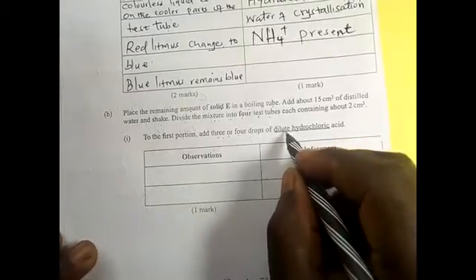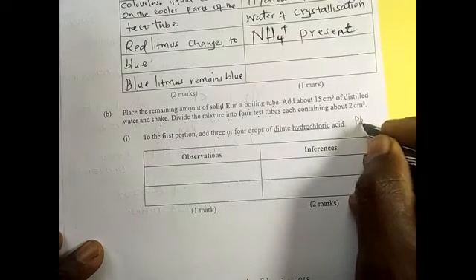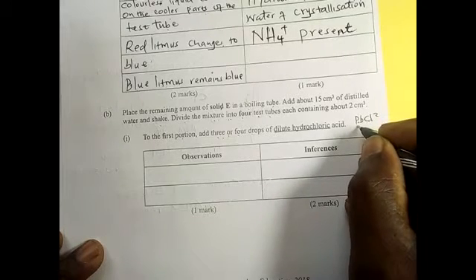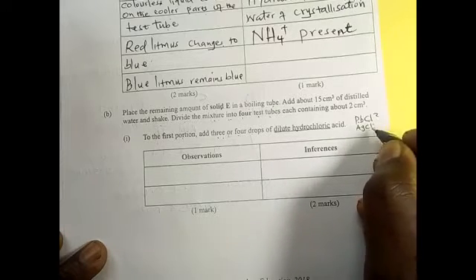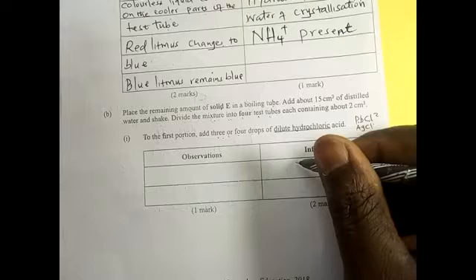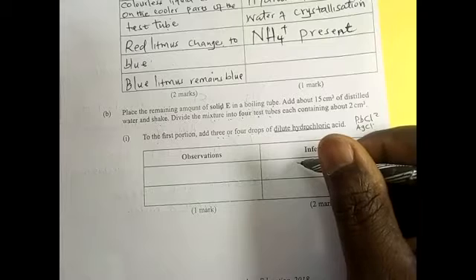Always when you are adding dilute hydrochloric acid, you expect a white precipitate of lead chloride. If there is lead inside, it will form a white precipitate. If there is silver, it will form silver chloride, which is a white precipitate. Those are the things we expect. Also, when we are adding an acid into a salt, we expect effervescence. If it is a carbonate, for example, it will produce effervescence. So you would also expect an effervescence.